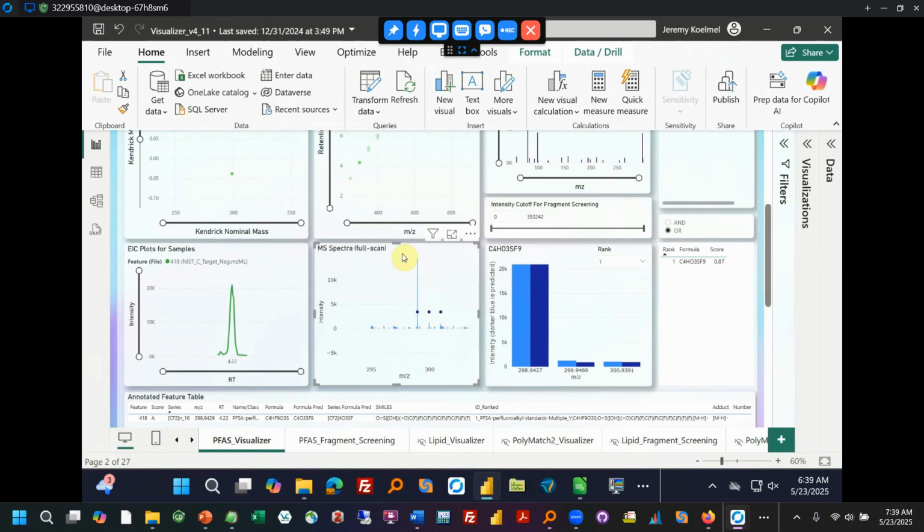And you can see that there's not many other peaks in the MS1 spectra, so that is good. Along the 1 Dalton around the molecule, this fragmentation is pure. It's mostly belonging to the ion that we're looking at.